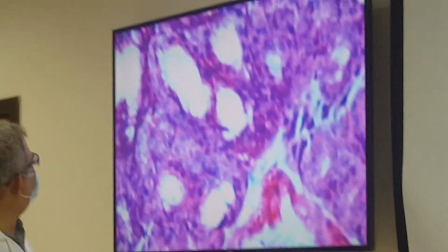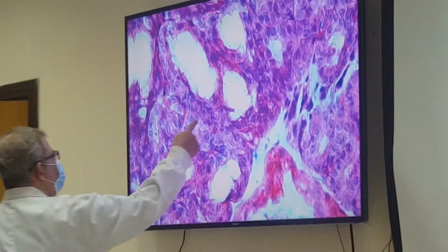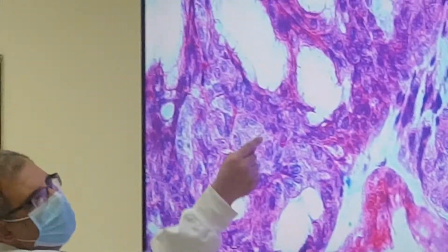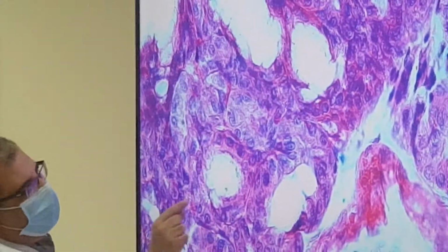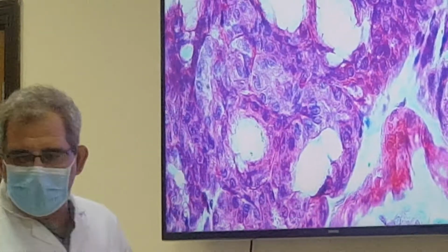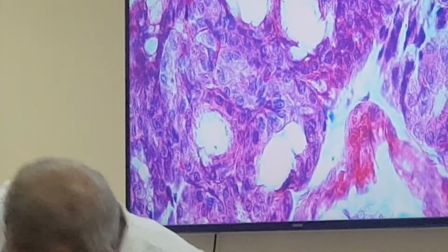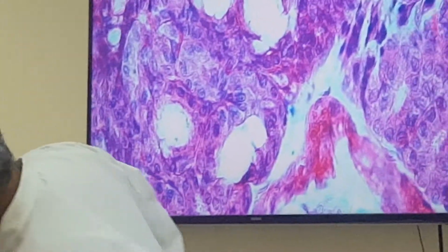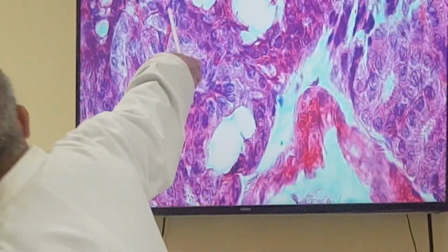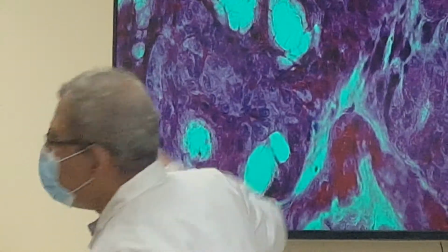Again, they are here next to each other, which is really better. Look at this appearance, for example, this one. These are cells next to each other. Right? And look at this one next to it. It's almost empty. Maybe if we reduce the microscope light, which won't really help because it will compensate. See how it appears like the foaming structure of the cells. And these are cells in the back.